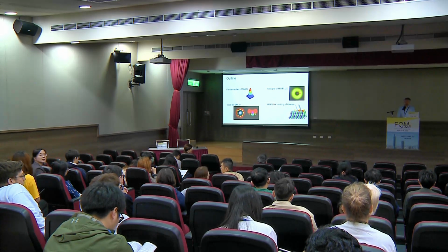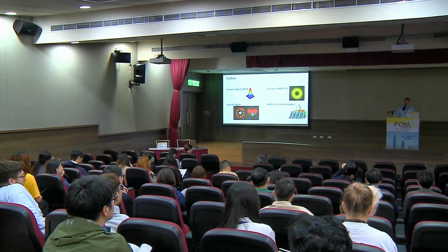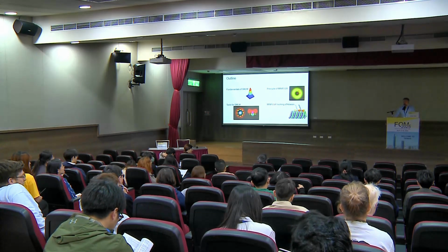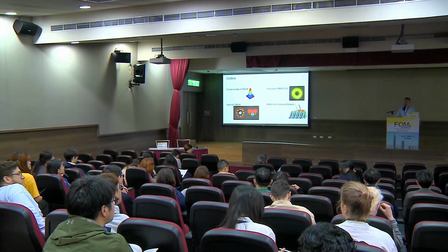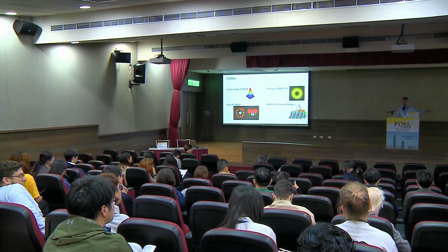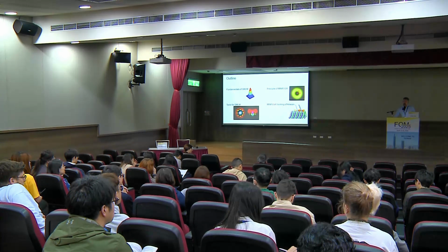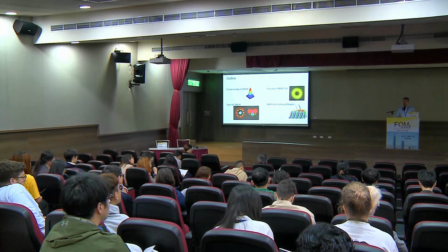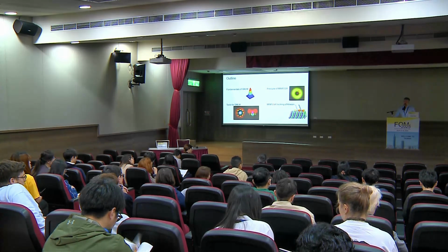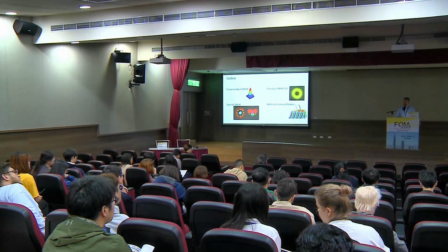Since I wrote the software, I would of course recommend my software SMAP, but I think the other one is probably as good. I don't really know what all you can do with Picasso. I think drift correction it can do, and then it depends on what else you want to analyze. Also, it depends if you want to fit the raw data again, or if you want to use the fit from the Zeiss microscope and then just analyze the data you have. If you use our software, I recommend you spend a bit of time going through the tutorials and getting to know it. It's quite complex, so it's nothing one can do within a minute. But I think it's worth going through this and learning how to use it. And if there are any questions or bugs, please write to me. Thank you.